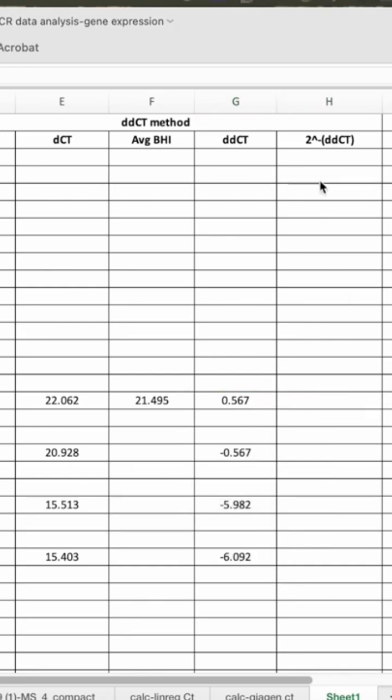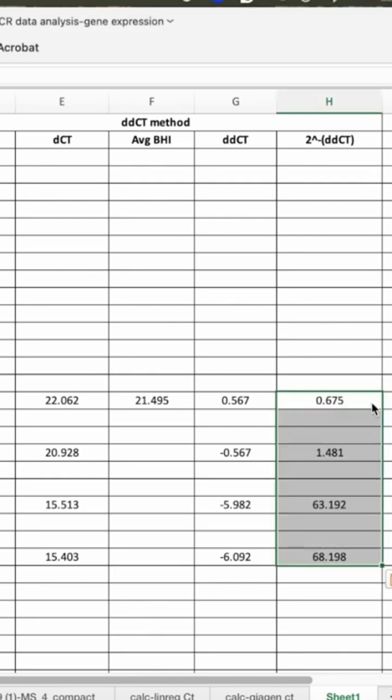The fold change is referred to 2 to the power minus delta-delta CT and here I calculated these values as this one.